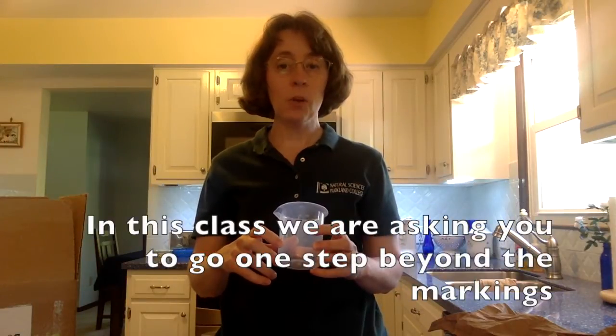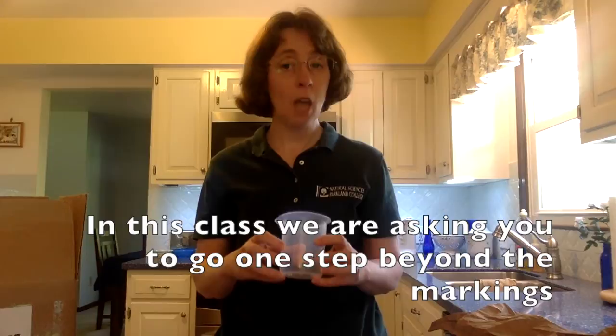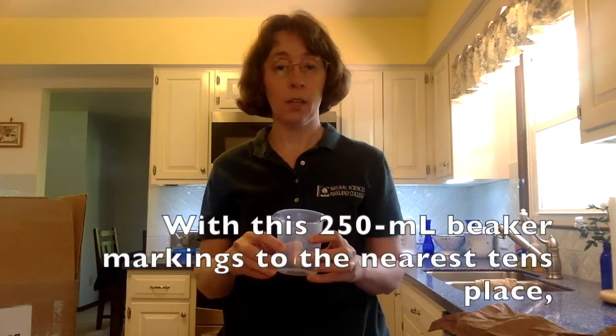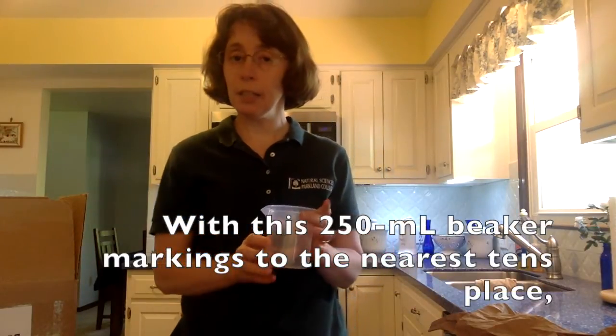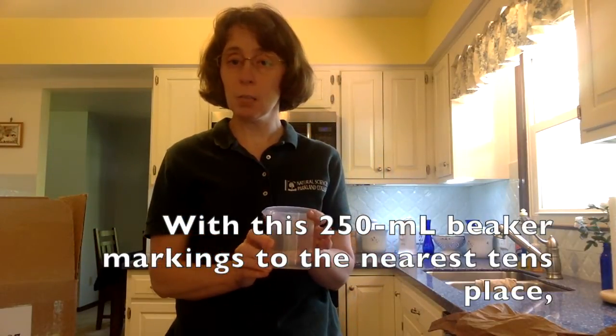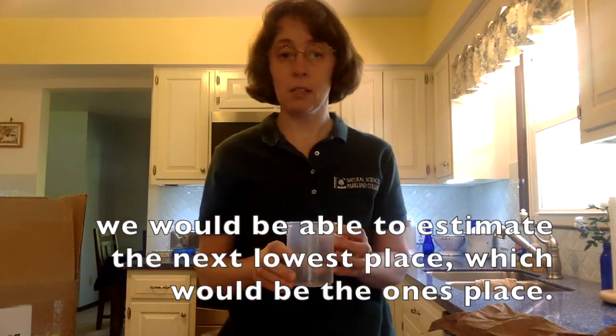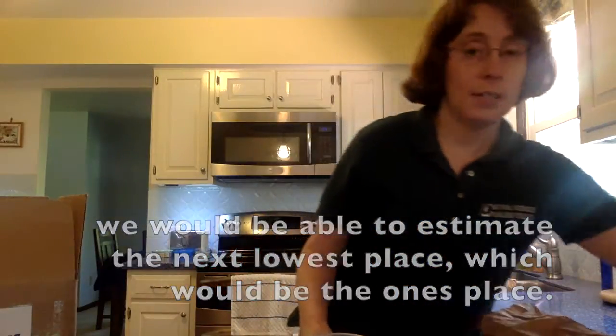In this class, we are asking you to go one step beyond the markings and measure like a scientist by estimating the next place value. With this 250 milliliter beaker markings to the nearest tens place, we would be able to estimate the next lowest place, which would be the ones place.